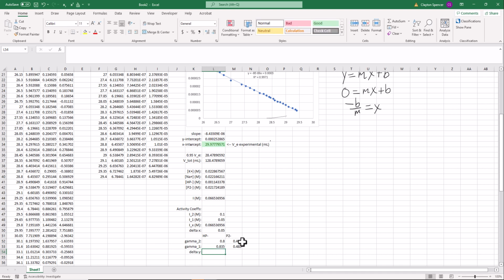That's just going to be equal to y2 minus y1. Enter. And we can just copy and paste that formula over to the right-hand side here. Good. And so we got those two differences. And now we're ready to have our gamma underscore y colon. This is where we want to type in our linear interpolation formula. If you have that formula handy, we're going to type that in.